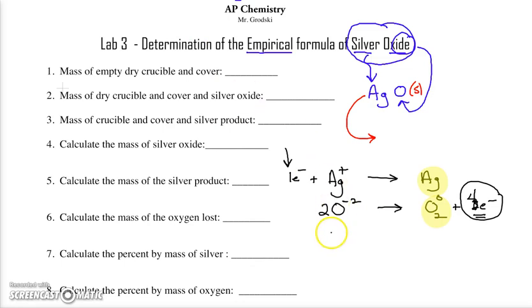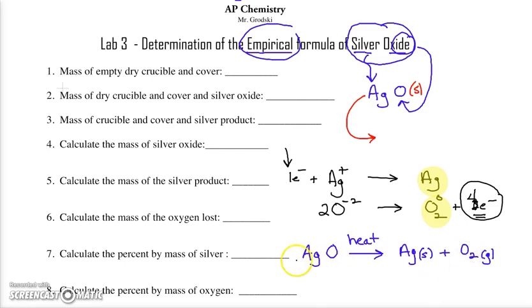And the reaction that you're dealing with is essentially silver with oxygen. We don't know the chemical formula. That's what this lab is about. And we're heating it to force the ions away from each other, to give them a chance to have that oxidation reduction reaction occur, to make elemental silver, which will be a powder form, and the oxygen gas, which is going to leave. And now we know that to be diatomic. The question is, what is this formula?